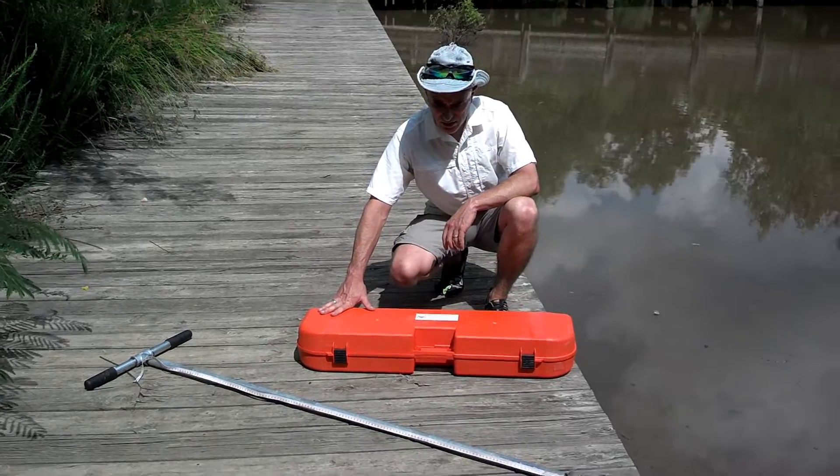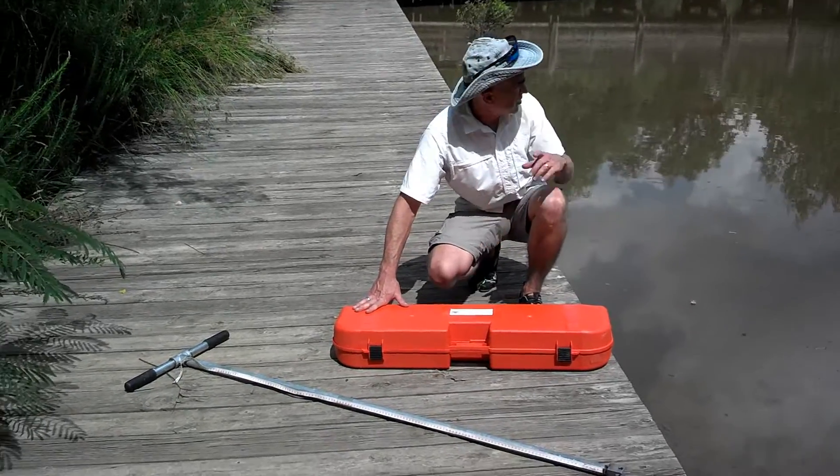I want to show you how to use the Wild Coat Corer to extract lake sediments from a pond such as this.